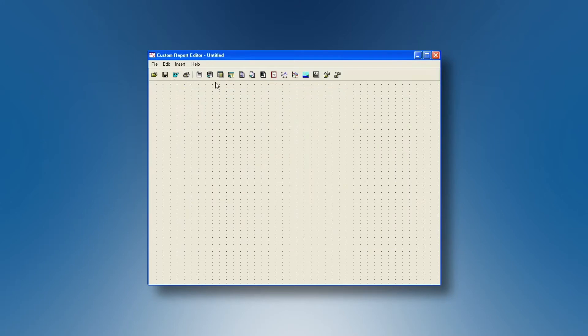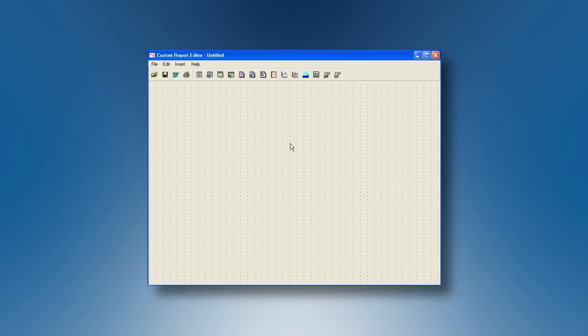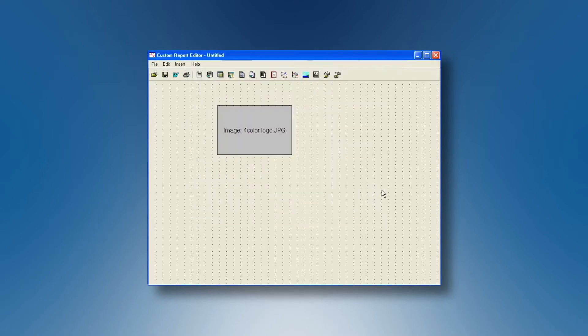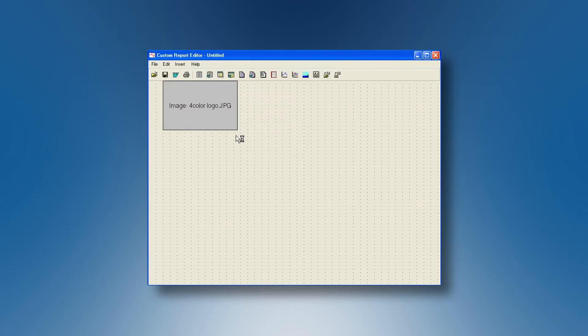And then in the icon list here we have objects. All these objects can be put on the blank page to generate your custom report. For instance you can import an image like this one. Your image can be placed where you want on your blank page. You can give it the size you want and it will be pasted here.